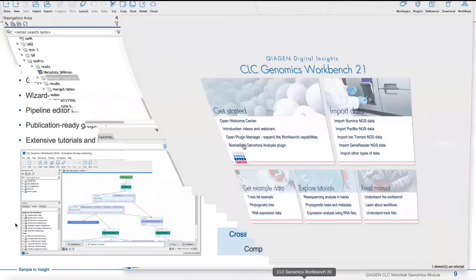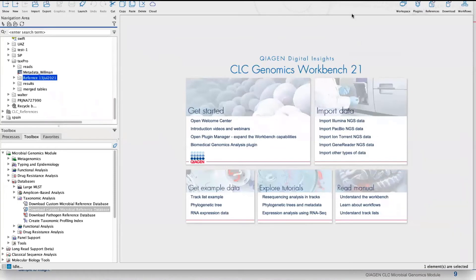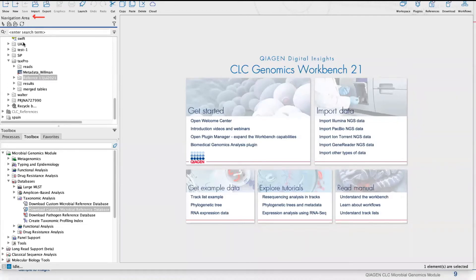Jumping into the workbench for a quick second, I always like to point out a few things before we get started. First and foremost, in the upper left-hand corner we have the navigation area. The navigation area is where we store data — it's a folder system with folders, subfolders, and files within those folders, consistent with the way you'd look through your folder structure in Windows, Linux, or Mac.